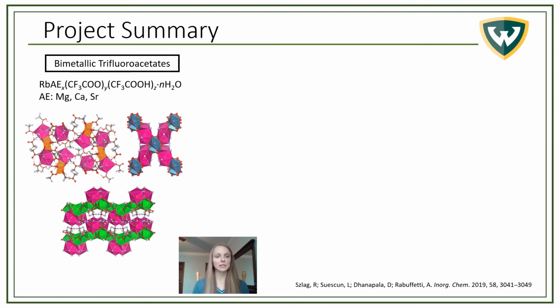I synthesize these materials via solvent evaporation, which in theory is simple, but it takes a lot of optimization. However, all I have to do is dissolve my metal carbonates in the trifluoroacetic acid and water, and then I heat and flow nitrogen for 2 days, and at the end I get a dry product, from which I can isolate single crystals. From there I was able to analyze the structure.